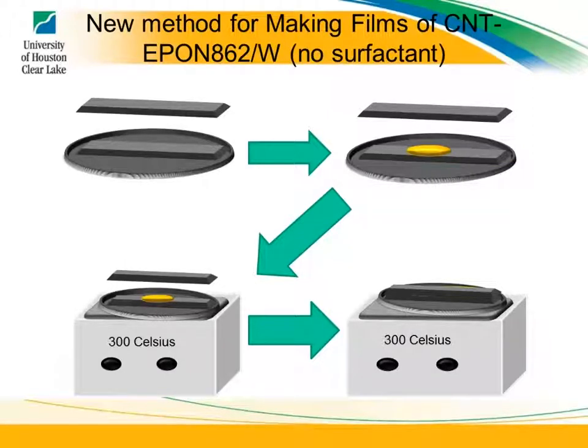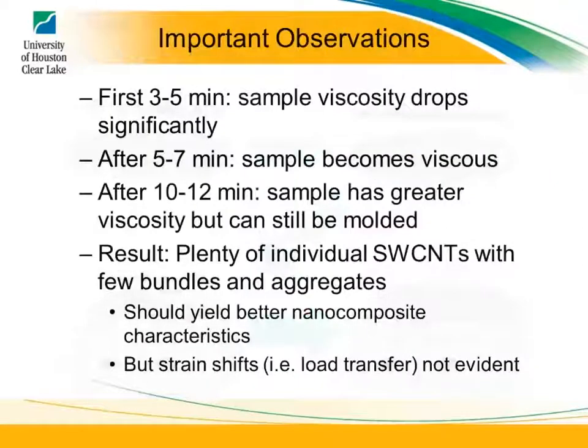We couldn't really tell exactly what the temperature is, if you've ever used hot plates in a chemistry lab. The setting that you set it on is usually a higher number than what the real temperature is. So it was above 100, probably around 200 Celsius, where the material was. And then we had it cured right away. And it was really interesting.